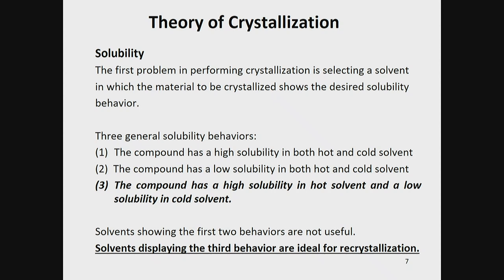This is what we're trying to achieve. So solvents showing the first two behaviors are not useful. Solvents displaying the third behavior are ideal, so keep that in mind. We want it to be highly soluble in hot solvent and have low solubility in the cold solvent because we want it to come back out of solution so we can actually isolate it.